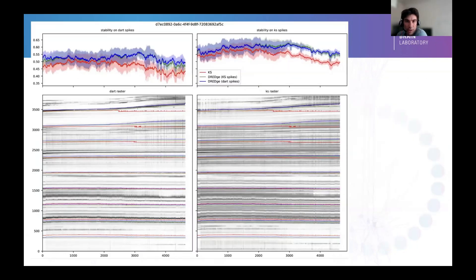Another thing I wanted to discuss is the drift registration. So here we can see in red, so we have raster plots on the bottom, and we can see the drift. And I'll show you the attention to the detected drift motion here. And what we can see here in red, the original algorithm did not fit this dataset in particular. And we have many more datasets where the drift correction was not tracking the actual drift on the data. So we decided to implement the dredge registration system, which is a non-rigid decentralized registration.